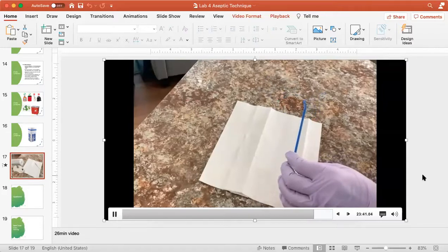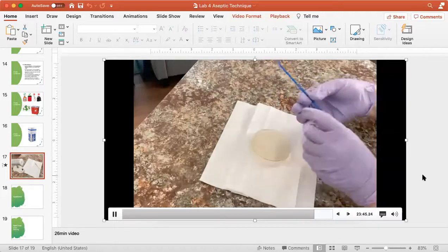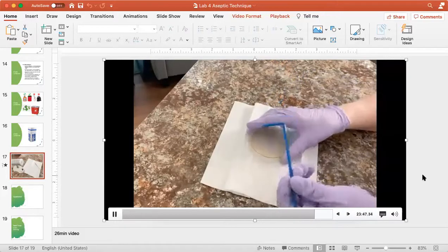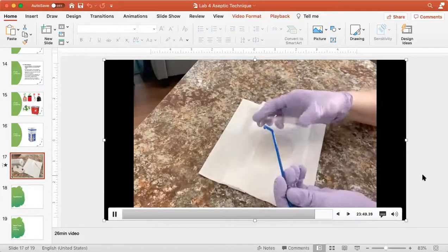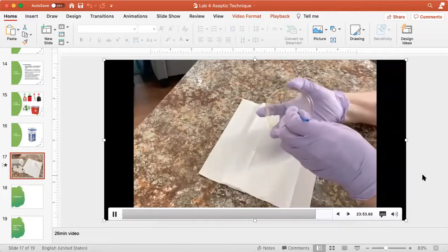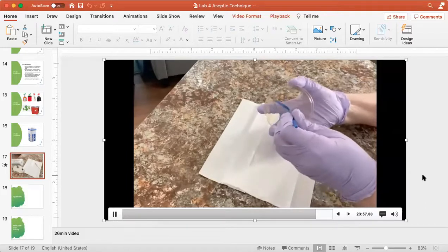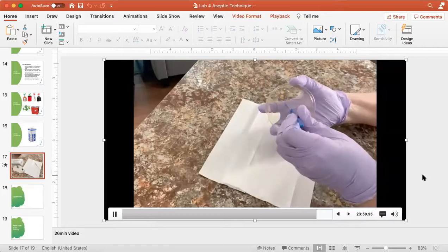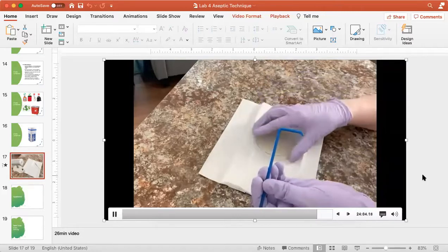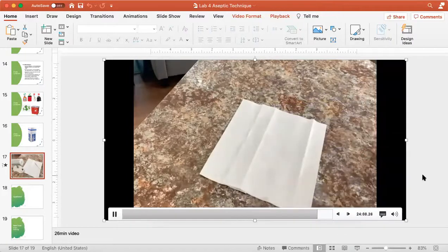We've looked at how we streak cells across a Petri dish, an agar dish. But sometimes we want to make a smooth coating of cells over the surface of that dish, and that's what the hockey stick does. See, you just swirl it around like the hands of a clock face, and you will spread your cells all over the surface of that plate, nice and evenly. One of my favorite tools in microbiology.